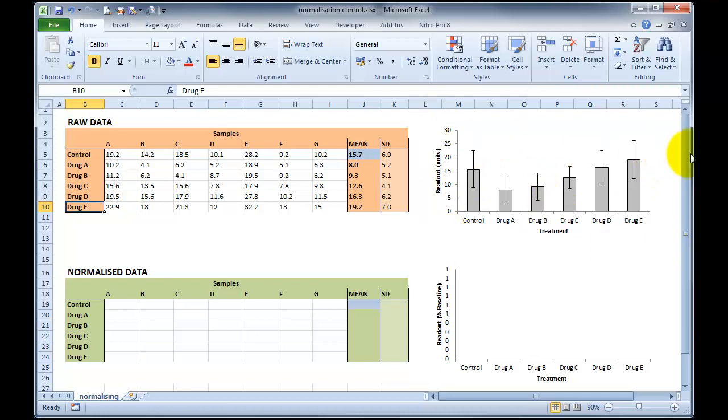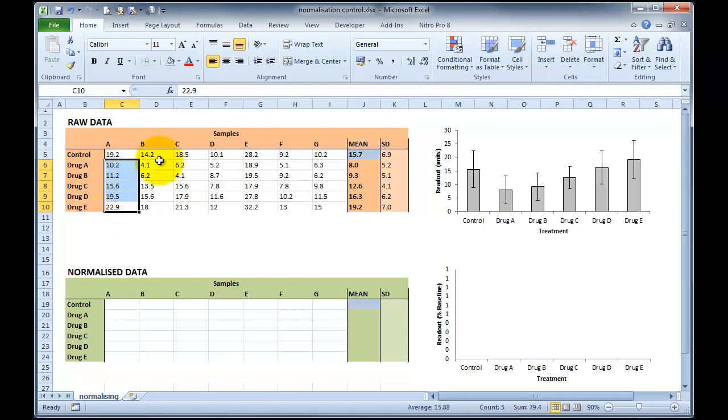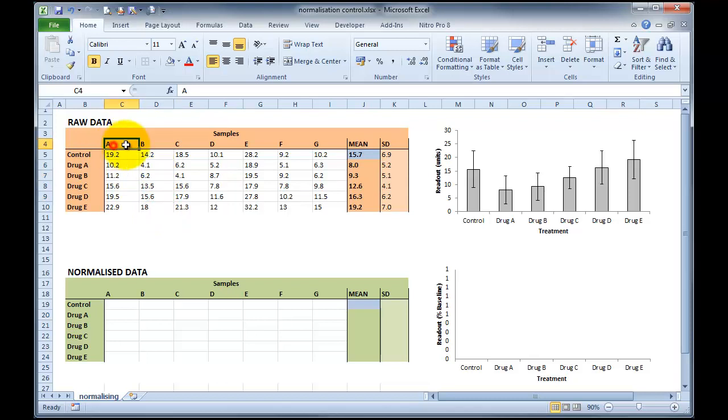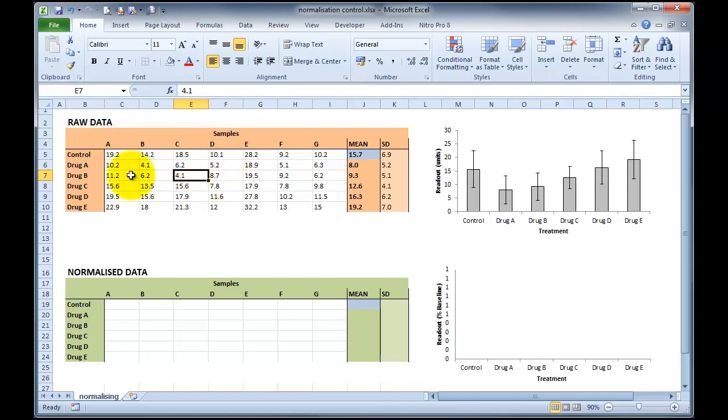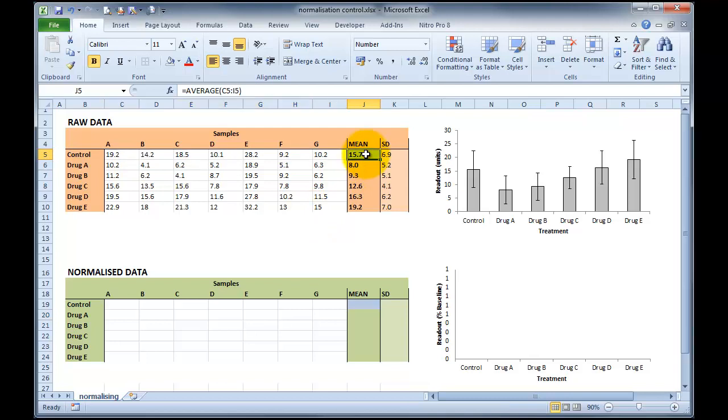To normalise these data, unlike our previous normalisation, we can't normalise all of A to its control. We can't normalise all of B to its control because they are in no way related to each other. They're merely just numbered in this order, and we might have read this plate before this plate or vice versa. It makes no difference. So we cannot normalise to each of these individual values. However, what we can do is we can normalise to the mean of all of our control values to create our new normalised data set.